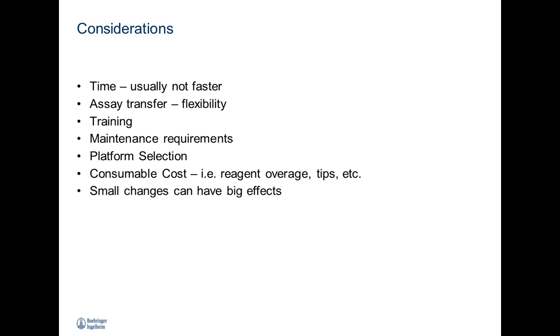Some individuals prefer to not have service contracts on anything. I've had managers in the past that have thought it was a waste of money. But vendors will provide several tiers of service contract, and it's just a question of, if you decide you want one, finding what level of attention and cost suit your needs.